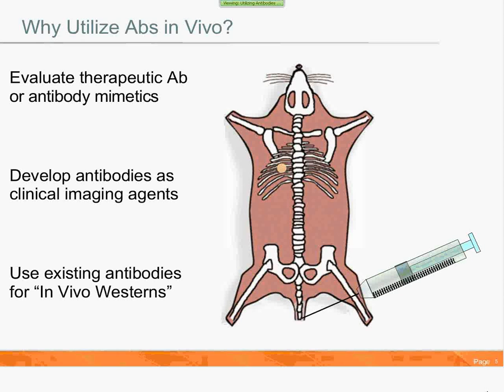The next question one needs to think about is, what are appropriate protein targets for imaging antibodies in vivo? In lysates or in immunofluorescence, you've pretty much disrupted the cell membrane, and in lysates it is completely disrupted, and for immunohistochemistry and immunofluorescence, you've often permeabilized the cells. So antibodies can get through the membrane.